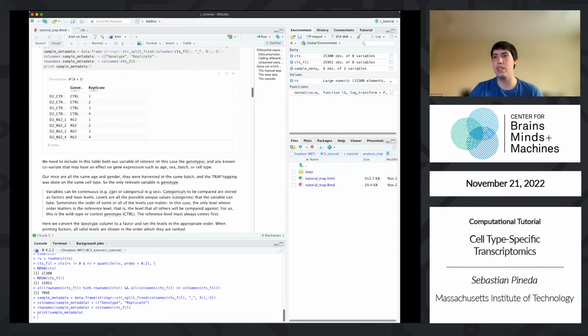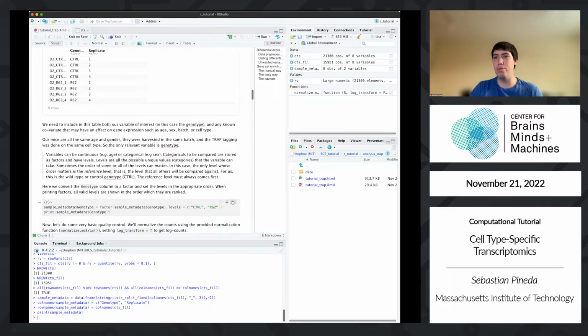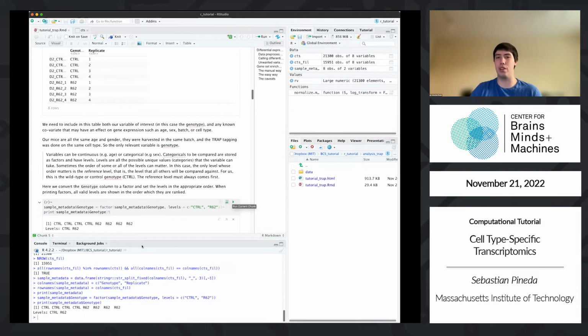Just very simple. And now, how familiar are people with the concept of differential expression analysis? I should point out, the typical analysis workflow when you generate RNA-seq data: you can do all sorts of fancy things, but the first two things that everybody does immediately are look at differential gene expression and pathway enrichment. That's the go-to.